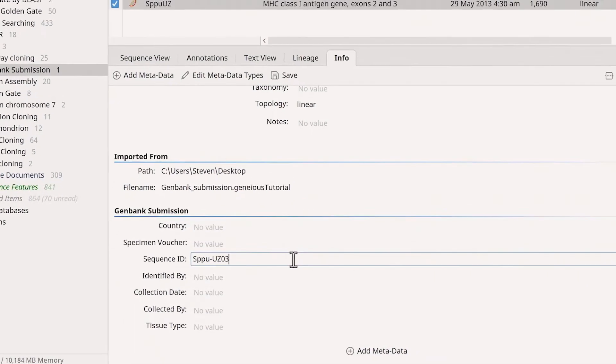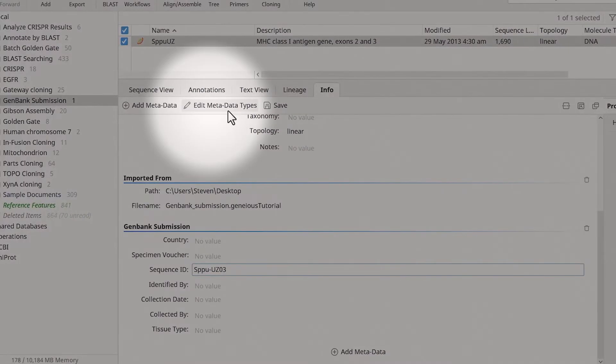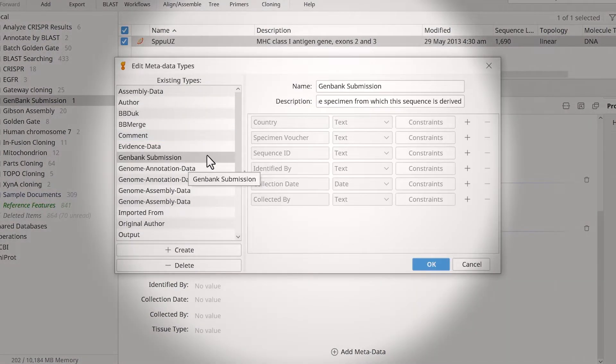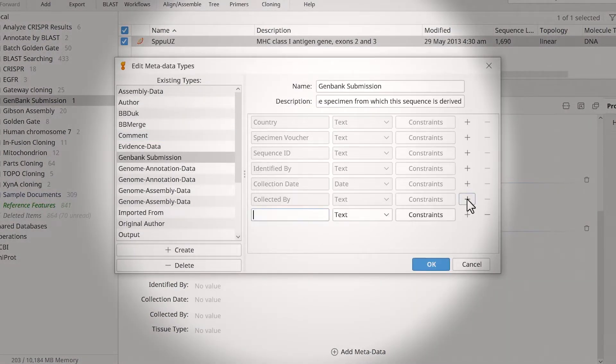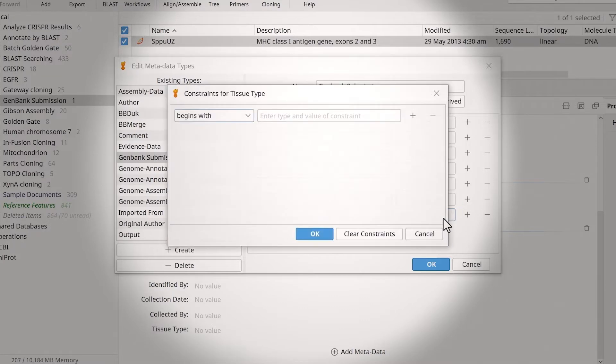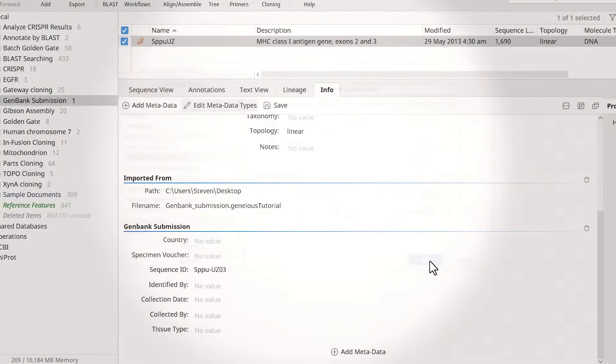To include other fields, click Edit Metadata Types. Then click the plus sign, name the field, and specify the input type via the drop-down menu. If desired, use the Constraints option to adjust the settings for the field. Once happy, click OK.